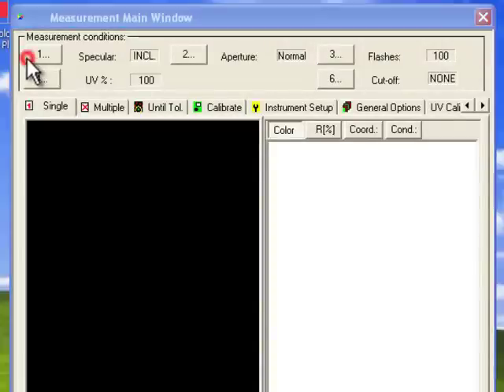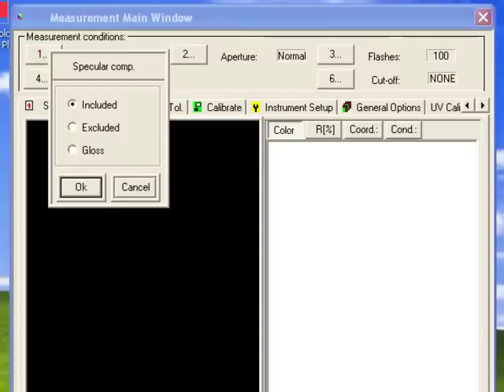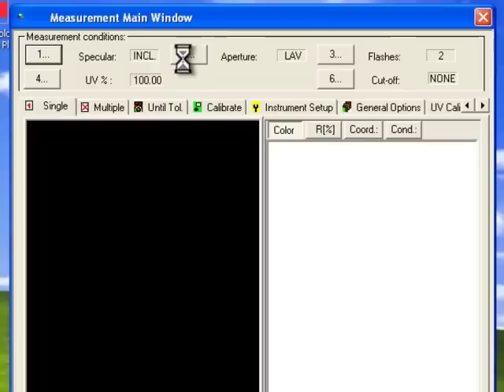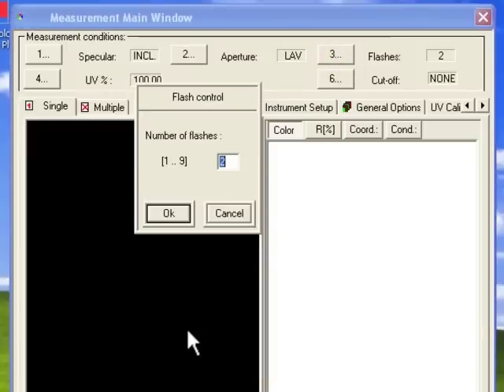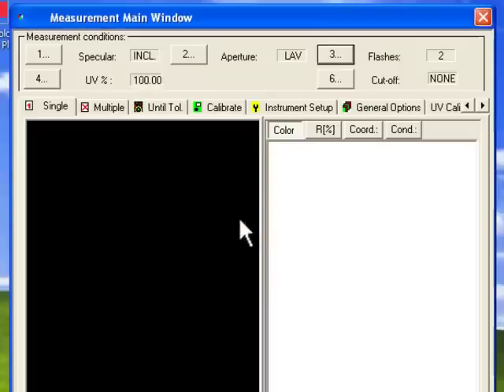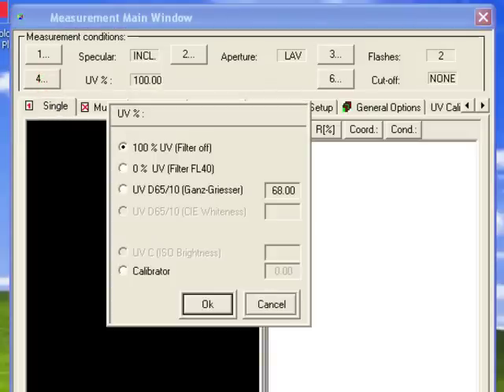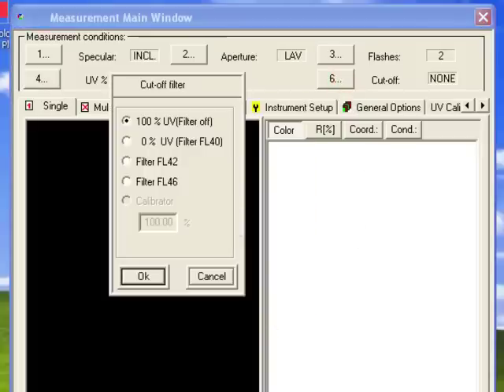Under Measurement Conditions, you have: 1. Specular, which allows you to change the specular, whether it be included or excluded. 2. Aperture, which allows you to change the aperture size that you're using with the instrument, and also auto-zoom functions. 3. Flashes, which allows you to set the number of flashes with the instrument per reading. 4. Percent UV being used. 6. Whether or not you're using a UV cutoff filter and at what position.